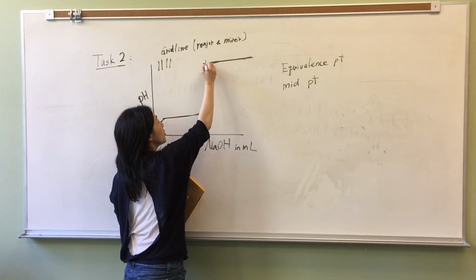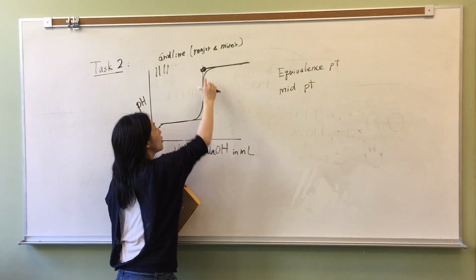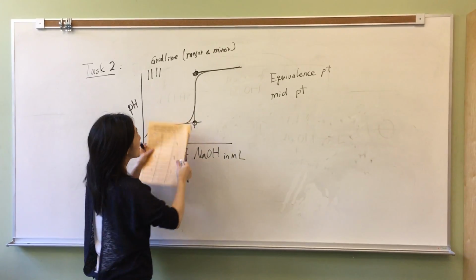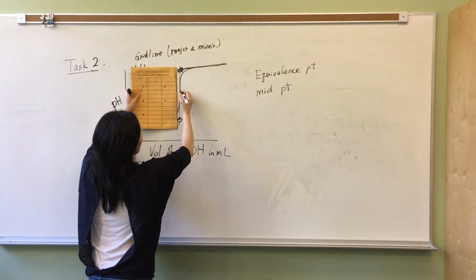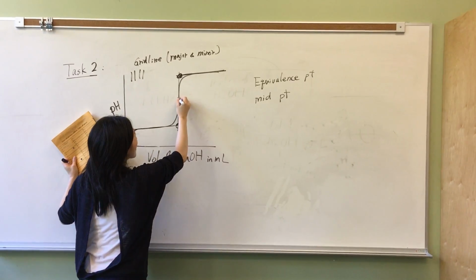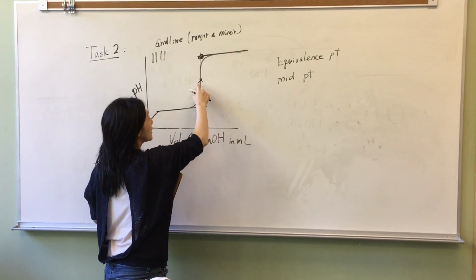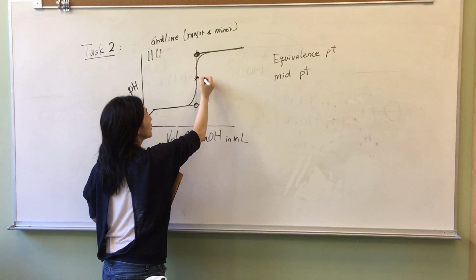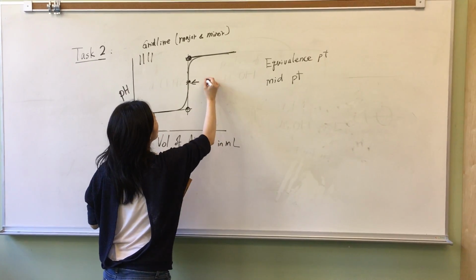And then you get the two intersections from those three lines. One is the top one and the other is the bottom one. Okay? And then you need to measure the distance between those two intersections, and then get the midpoint between those two intersections. The midpoint close to your pH graph, that's your EP, equivalence point.